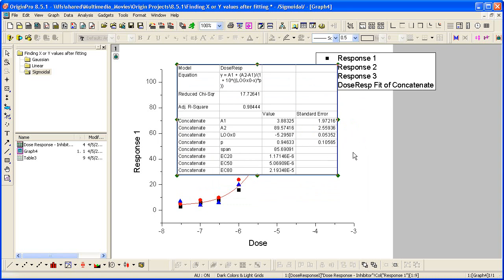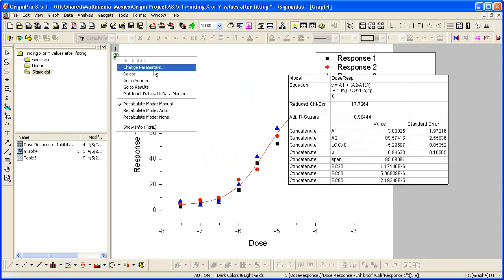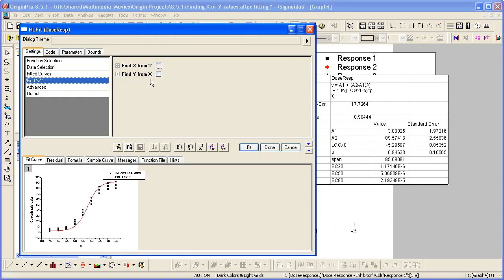So in the case of this function, we have three derived parameters. EC20, EC50, and EC80. But again, if you want to use this fit curve as your standard curve to calculate unknowns, you can always click on the green lock, bring you back into the dialog by selecting Change Parameters and enable it. Let's find X from Y.